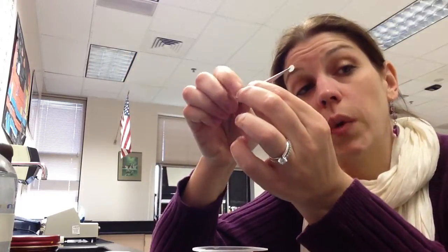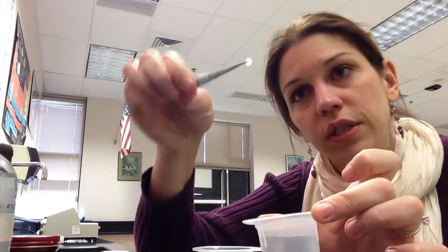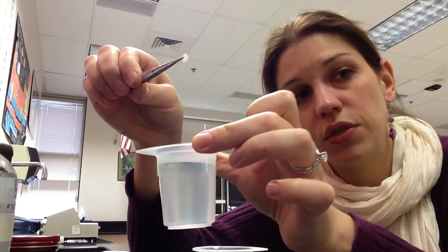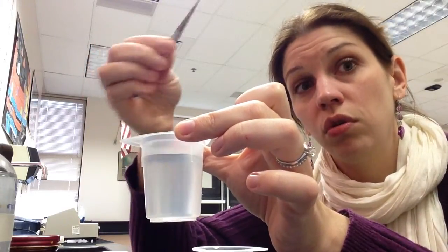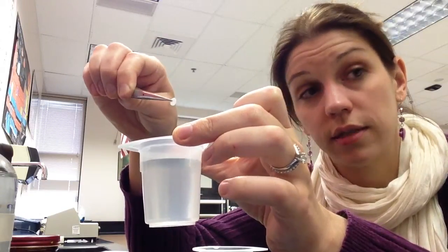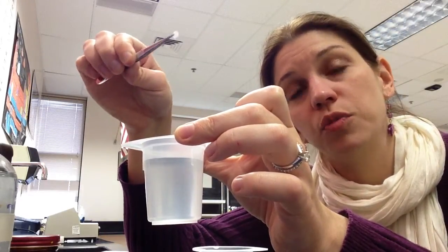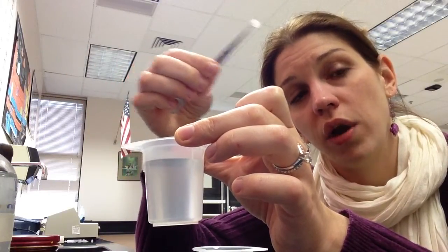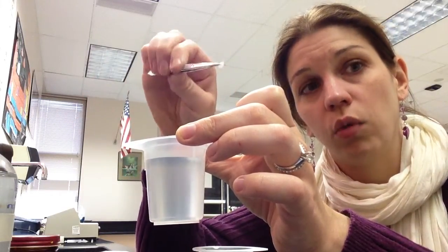Then this requires a partner, and in fact you should be working in a group of 3 or 4, so this shouldn't be an issue. What you do at this point is that you have your substrate here, and here's your enzyme. As soon as these two make contact, your reaction has started, and so somebody has to be timing this. You, with the forceps, are going to release your disc in the middle of your substrate, and it's probably going to sink to the bottom at first, but then as this reaction is happening, oxygen is going to be produced right where the reaction is occurring, which is on the disc. And so bubbles will accumulate, and then it will rise to the surface.